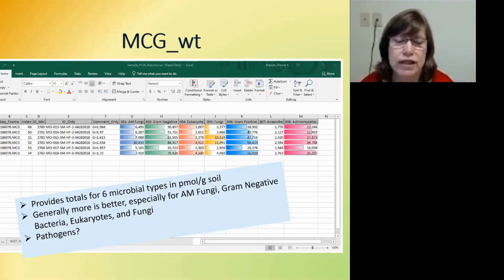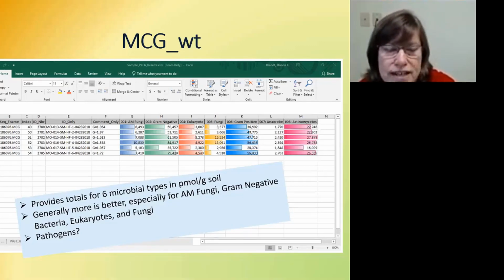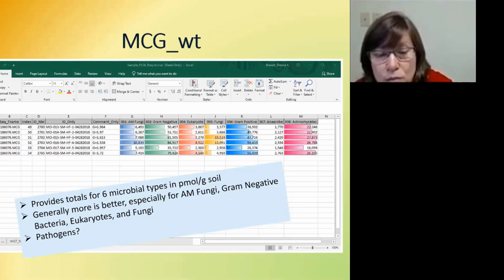other nutrients are released. Fungi also help with aggregate stability and performing other functions in soil. So usually the more the better of these also. You do have to remember that pretty much any of these except for mycorrhiza can also be pathogens. So if you have an excess of fungi, I have one client that will send in a set of samples, say good beans and poor beans.